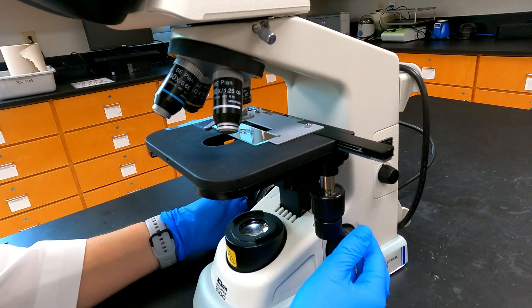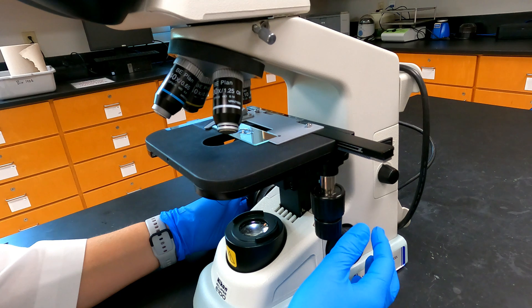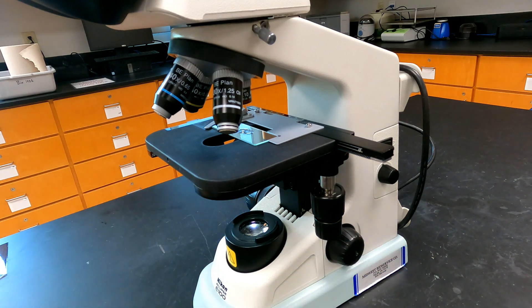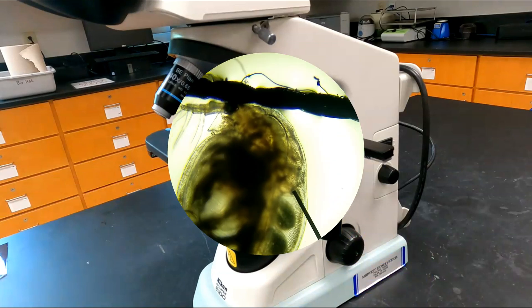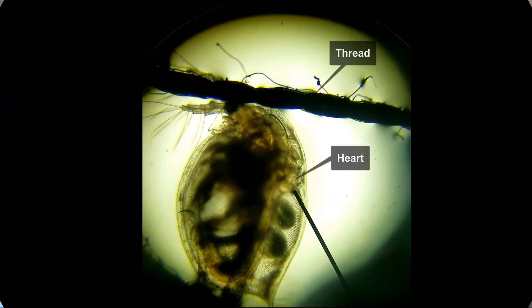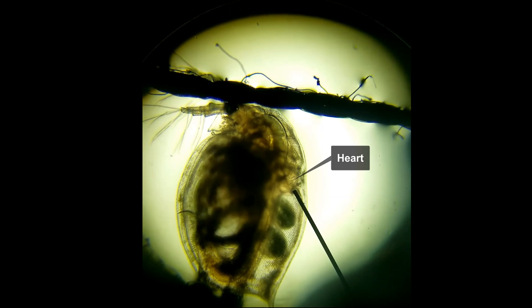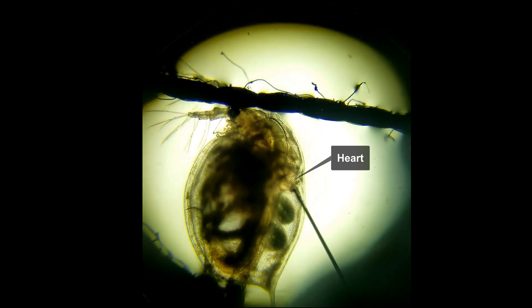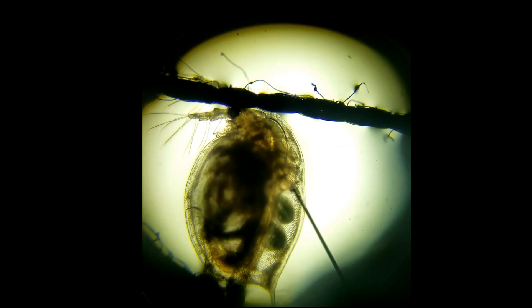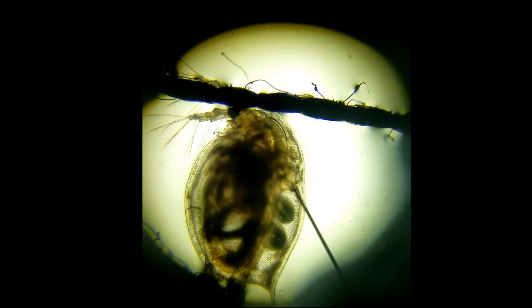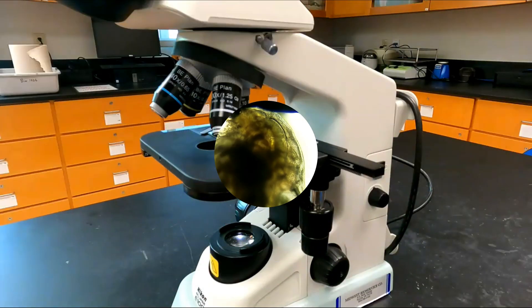Once you can clearly see the Daphnia under the microscope, locate its compound eye, antenna, and most importantly the beating heart. You may view your Daphnia at either 4x or 10x magnification, whichever helps you to count the heartbeats more easily. Follow the protocol to count the heartbeats for 15 seconds three times and then calculate the baseline heart rate per minute.